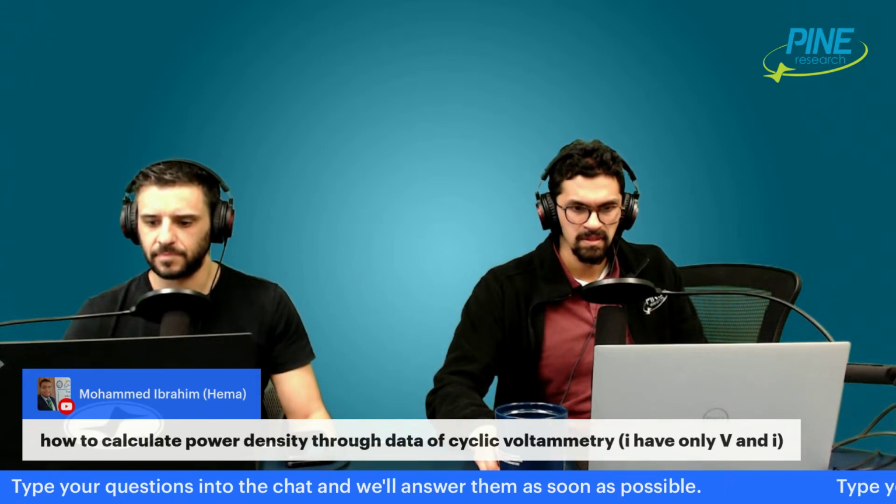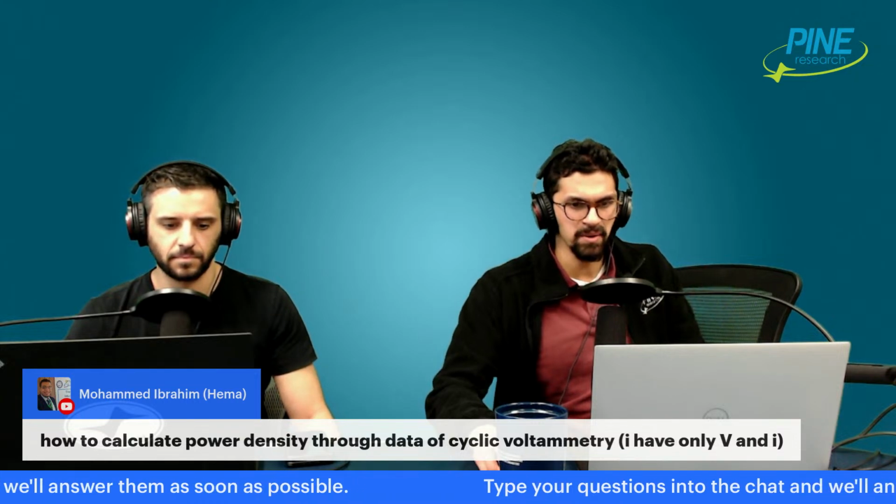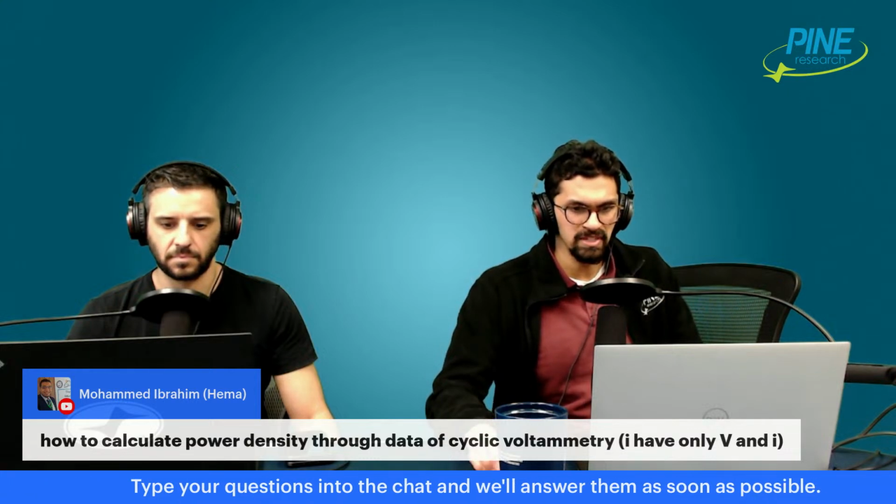Okay. All right. Moving along. Power density. Mohammed is asking how to calculate power density through data of cyclic voltammetry. I have only V and I.